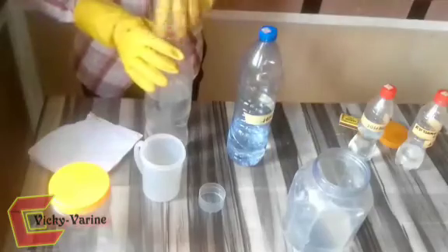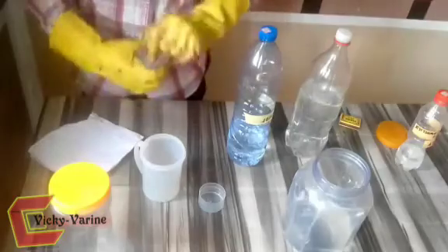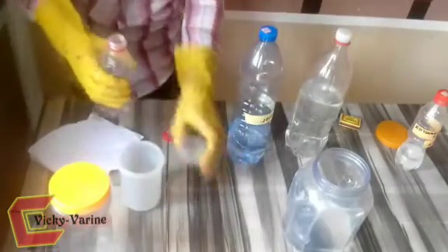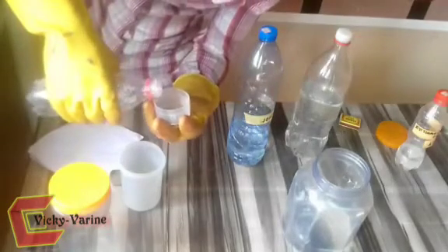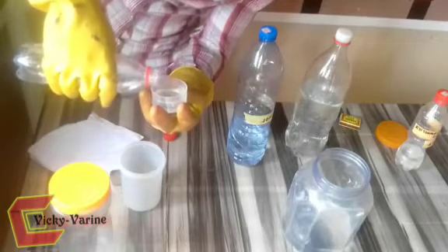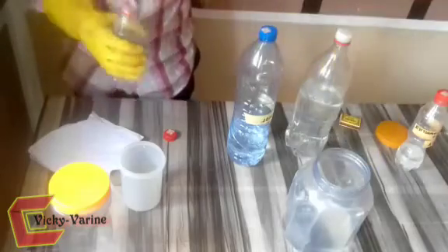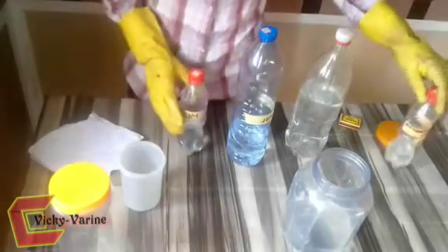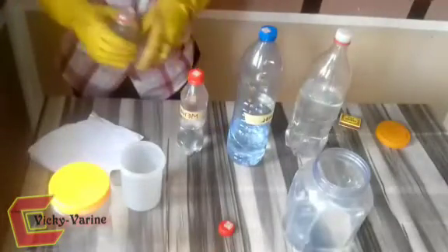For the methanol, you need to use 5%. Five percent of 500 ml is 25 ml. And the EDTA is 2%. Two percent of 500 ml is 10 ml.